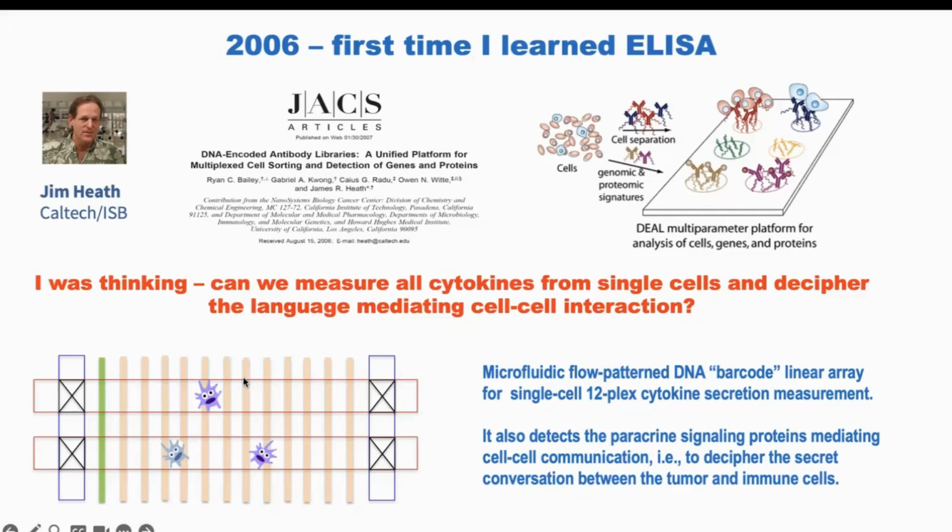each microchamber you use to capture a single cell is as small as 1 nanoliter. So you do your math. One cell in 1 nanoliter is equivalent to 1 million cells in 1 ml. When we culture cells in a petri dish or in a flask, that's a very typical cell culture concentration or density. So that means if this little guy is producing the same amount of protein in this tiny nanoliter microchamber versus in the flask, it should have more or less the same protein concentration. So the question: can we put all those different DNA antibody spots, or in this case, stripes, into a nanoliter microchamber? So that worked out, but that's not the focus of my talk today.